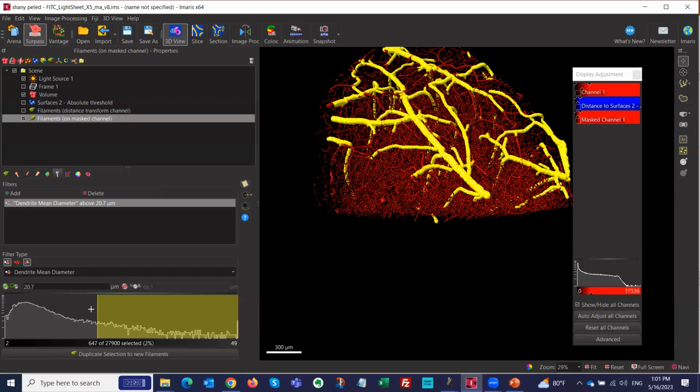Okay. So the question for those in Zoom is, if we have a microglia or some cell where we have the membrane stain, and the inside is not as bright, like it's hollow, the same as when we have a vessel that's very bright on the outside because of the stain, but inside it's hollow. The regular intensity-based tools are challenging for the absolute intensity and for the background subtraction. Yes, that's why machine learning definitely does help. So this is how you fill holes, like if a microglia or any cell where the outside is really bright, the inside is hollow.